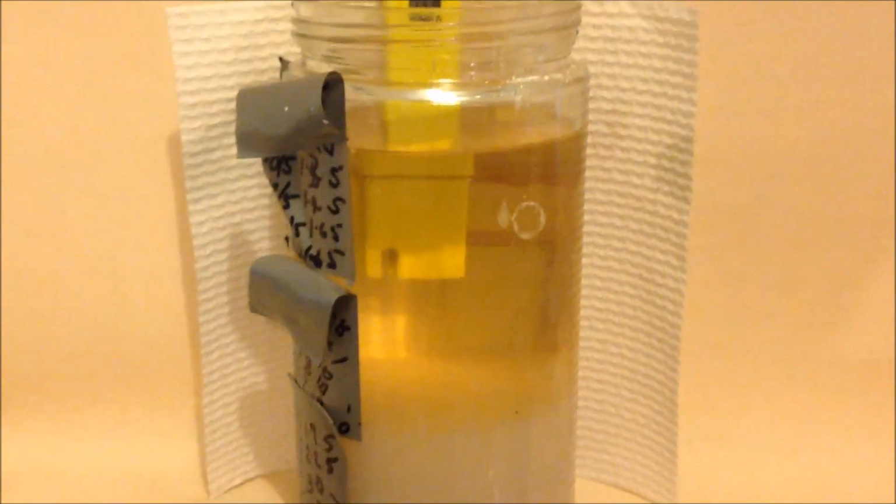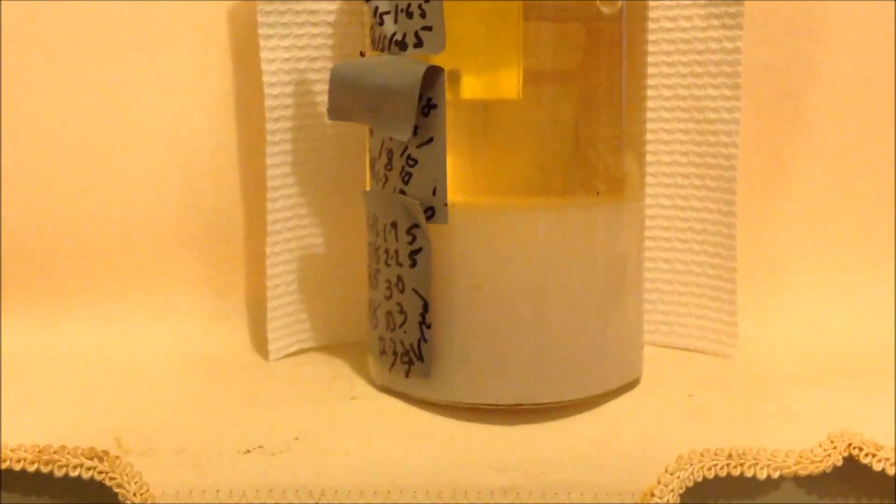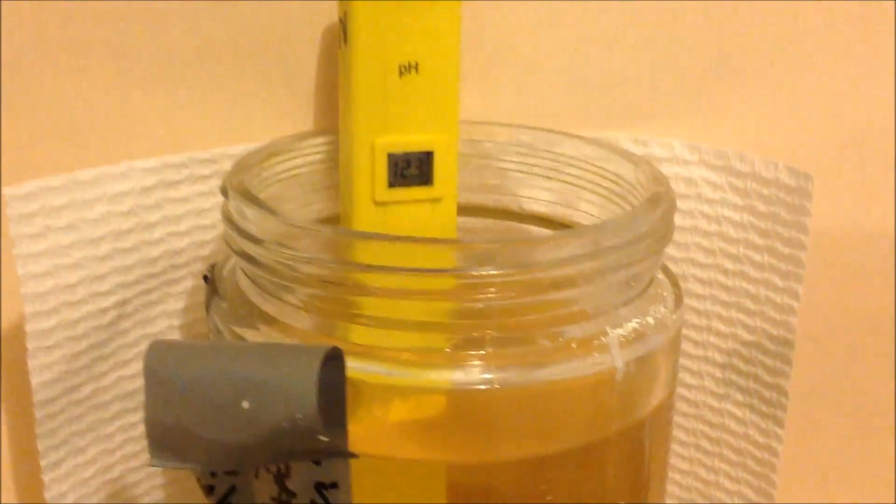Here's something else I haven't seen before. It's been less than an hour and it's just dropping out very quickly, so the precipitate's very dense and very discreet in the solution. I'll have to go to work now.